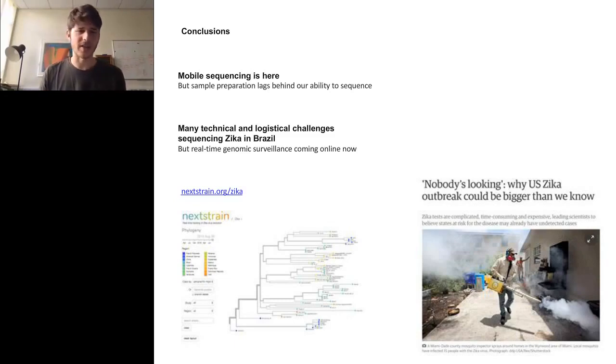sorts of specialized labs. So once we've got the RNA, or DNA, we're then working on ways that we can improve the speed at which we can go from a sample to a sequencing library. At the moment, that includes using PCR to amplify a very small number of molecules that's in the sample to a larger number, so that they can be used for sequencing.